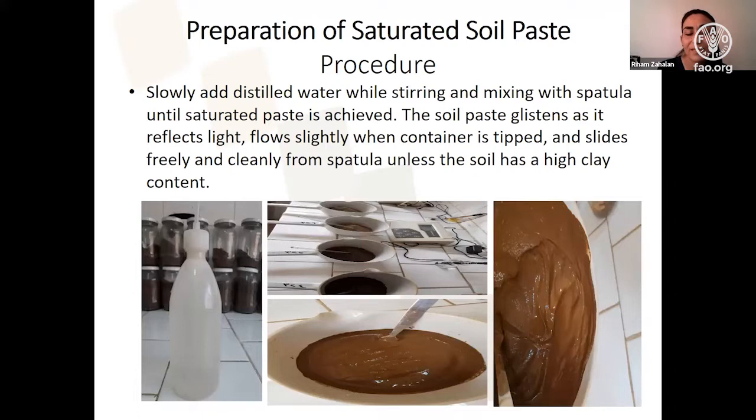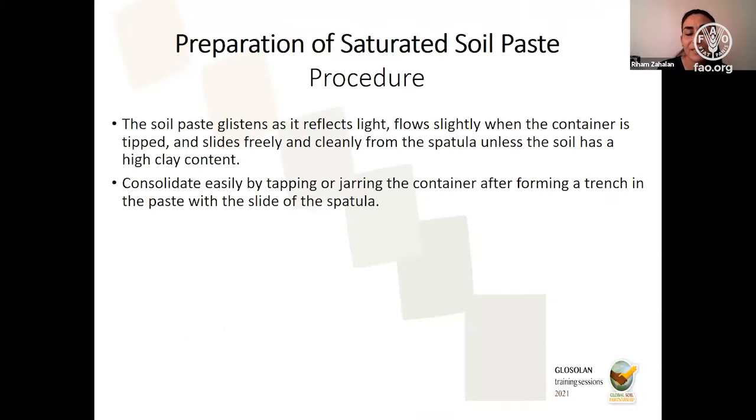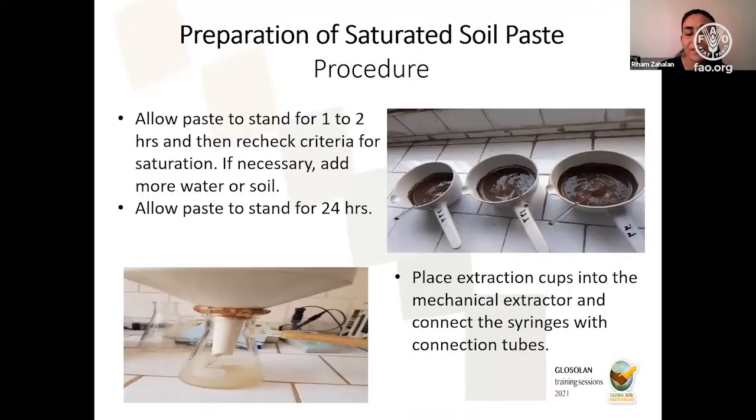And if you draw a line in the middle of the soil paste, it can fill up or merge again if you only gently tip the edges of the dish. We can see pictures of these characteristics in the further slides, so I'm going to move on. After that, it's perfect, but we didn't finish yet.